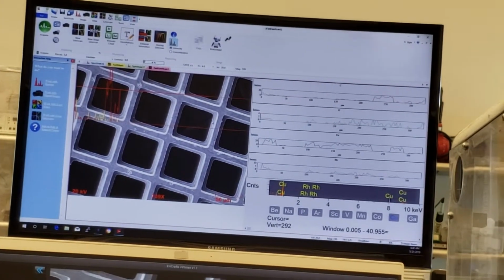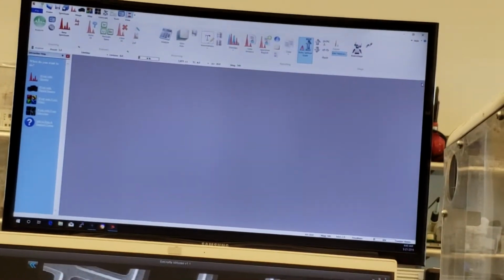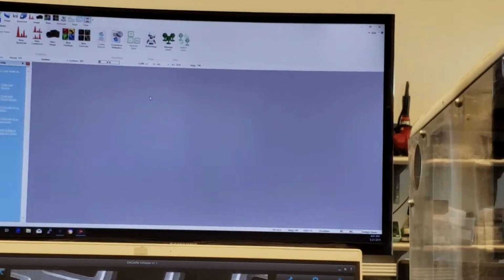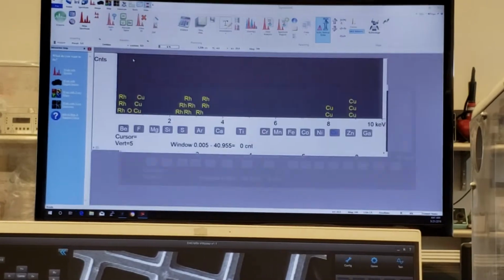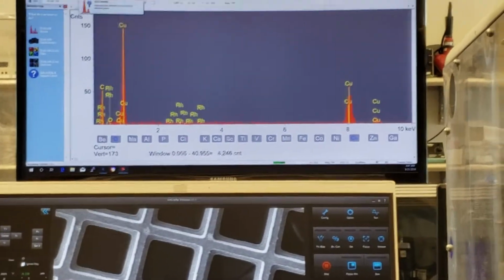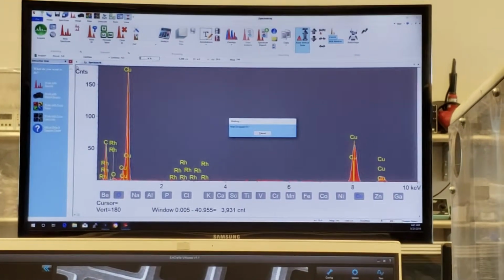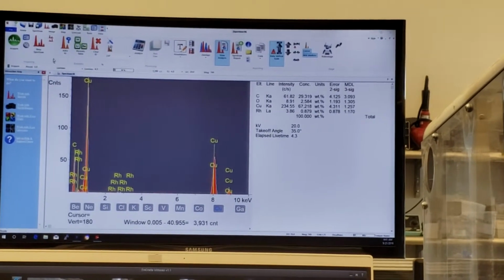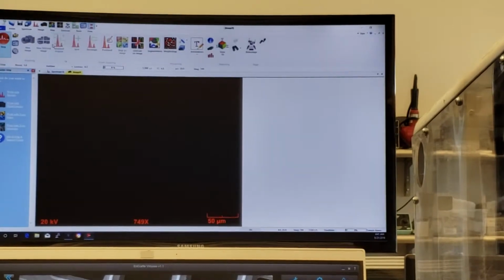So you got a lot of stuff here, but realistically, in all intents and purposes, and this is the same thing for you, Mark, realistically, the software opens as such. This is how it opens, from scratch. Yeah. So it's like, what do you want to do? I just want to collect the spectrum. There's your spectrum. Okay, I would like to ID the spectrum. Click Auto ID, hit stop, and the calculator's live, analyze. Done. Bang, there's your numbers. Very quick. I would like to collect an image. So you go back to your home, collect an image, and there's your image.